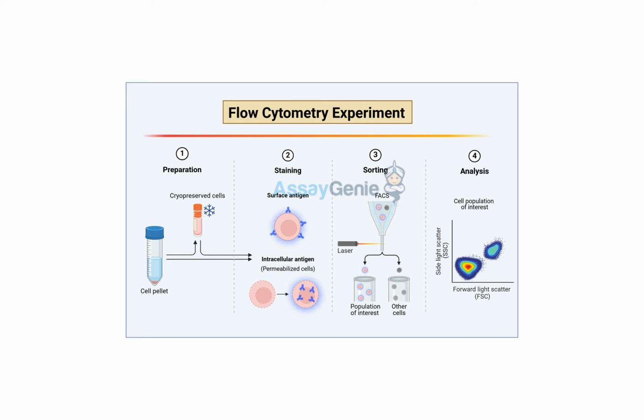Ah, the fluorescent tags. These are really cool. They're like tiny beacons that allow us to actually see what's happening under the microscope. So they light up. They light up when you hit them with a laser, they emit light at specific wavelengths. And then we can use that light to identify and quantify our target proteins. So we're basically lighting up the cell from the inside to see where our protein is hiding. You got it.